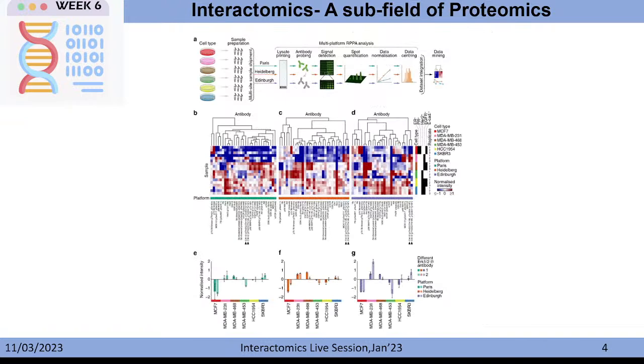Here you can see the cell types. The platform robustness can be checked starting from the six different cell line types. Then their samples were prepared, so here there is no difference; the variation has been cut off. It does not happen that variation occurred during the stage of cell lysate preparation or during the RPPA. That had been cut off by preparing the samples centrally.